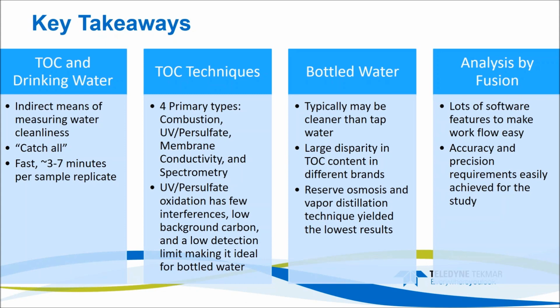Bottled water typically may be cleaner than tap water. So again, that's good to know that, when you spend that dollar on that bottle of water, you might actually be getting something that's cleaner than what comes out of your tap. There's a large disparity in TOC content in the different brands. So the brand matters, maybe, perhaps you can conclude that. And reverse osmosis and vapor distillation, for this study, yielded the lowest result of TOC, which you could indirectly say made it the cleanest bottled water.